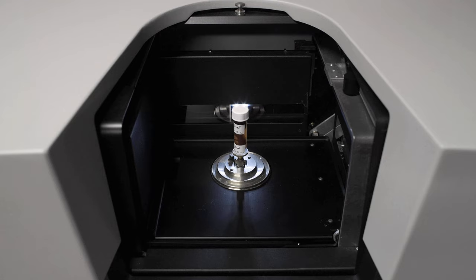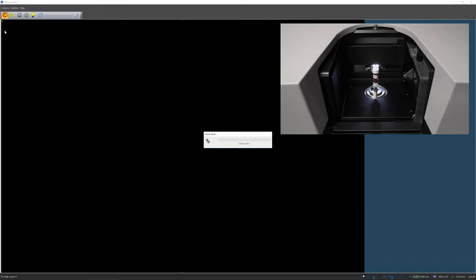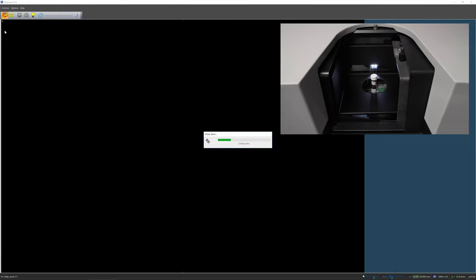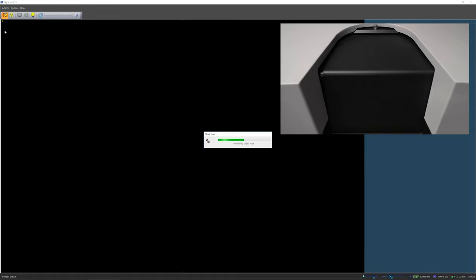Once the sample and the brass holder have been securely mounted, make sure nothing is left on top of the protection plate before you close the chamber. Click on the open/close sample chamber icon to close the chamber door. Once the chamber door is fully closed, the progress dialog will disappear. We can now proceed to start setting up the acquisition parameters.